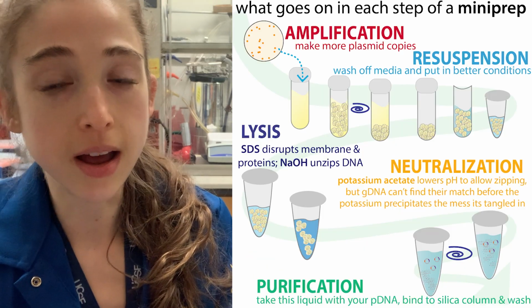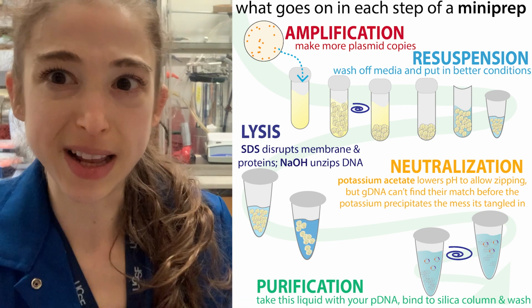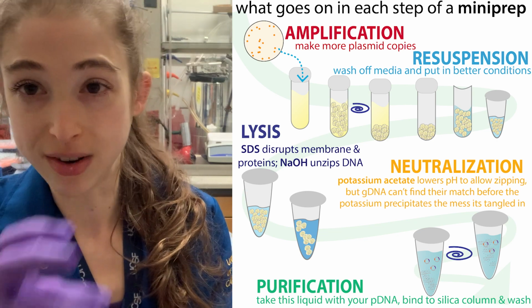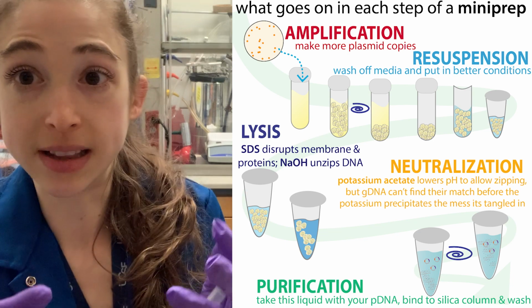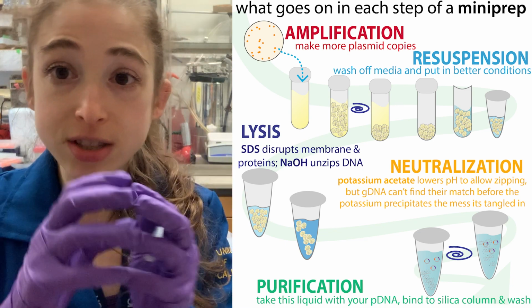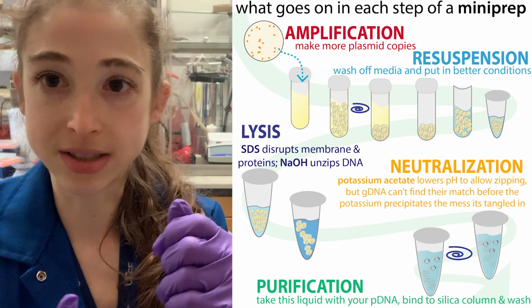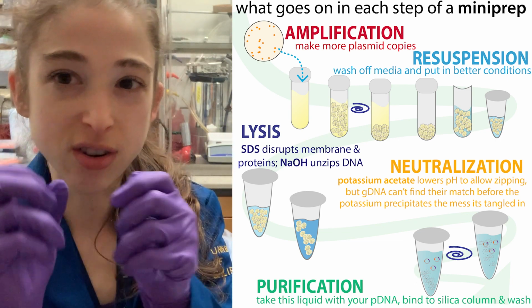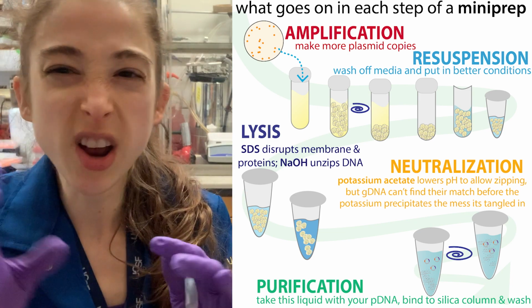Another time it comes into play is when you're doing something like a Miniprep, when you're selectively precipitating out various things. In a Miniprep, what you're trying to do is isolate a plasmid, a circular piece of DNA, something that you cloned maybe, that you put into bacteria. You have to break open the cells and you want to isolate that plasmid, so you want to precipitate out all the other stuff. You add base and acid and stuff like this, denature all the proteins, get those to come out of solution. You've got the membrane bits, you've got all this gunk.